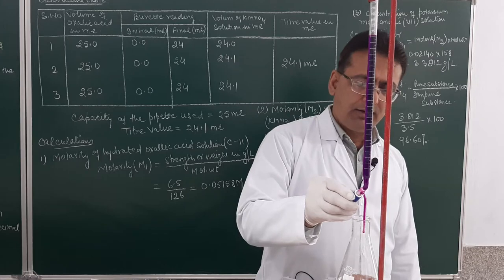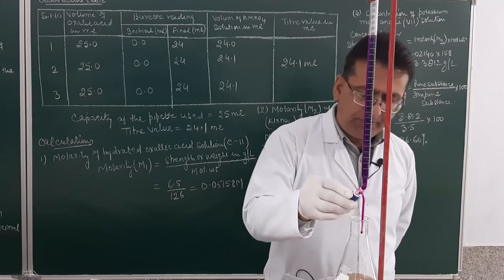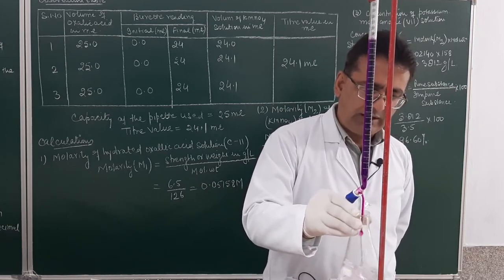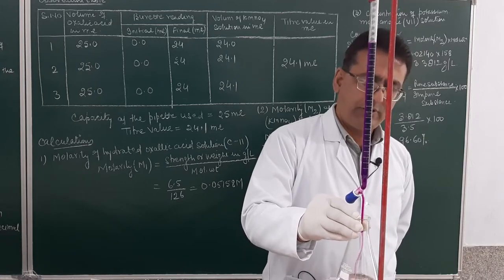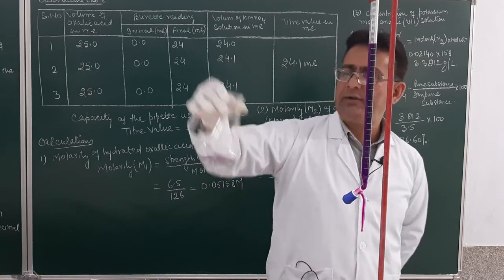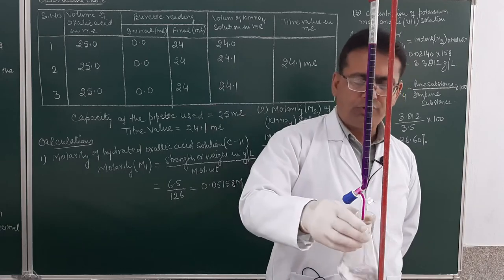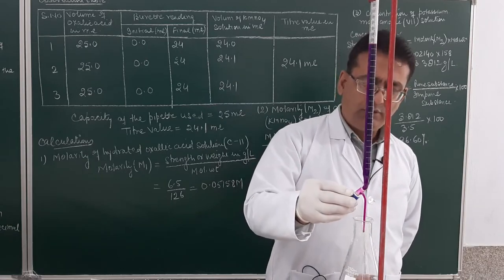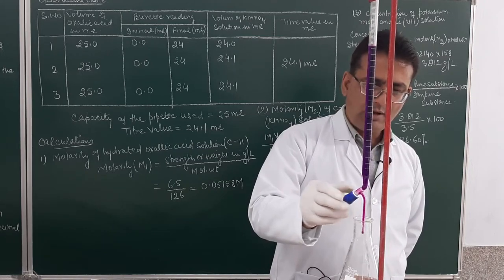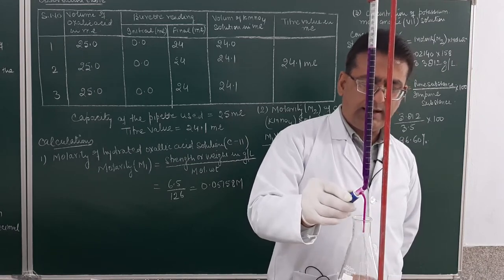Whenever you think it is nearer to the light pink color, slow down the speed of addition of KMnO4 solution so that you can clearly observe the color. Now you may see, student, over here, this requires hardly a drop or 2 for obtaining the persistent pink color. Now this over here is almost there.